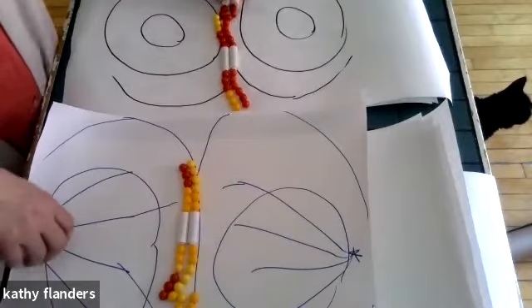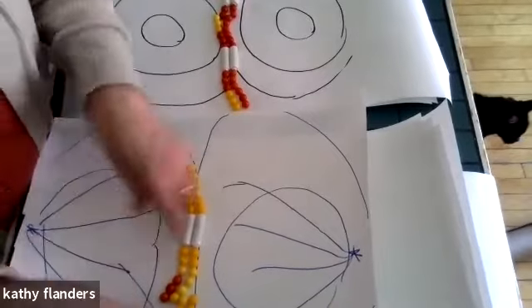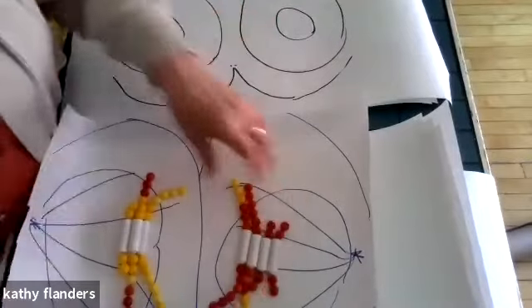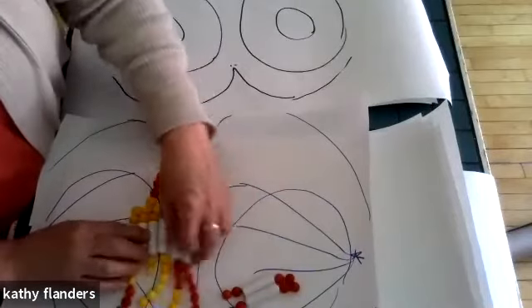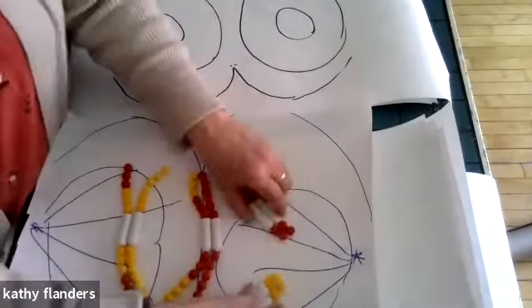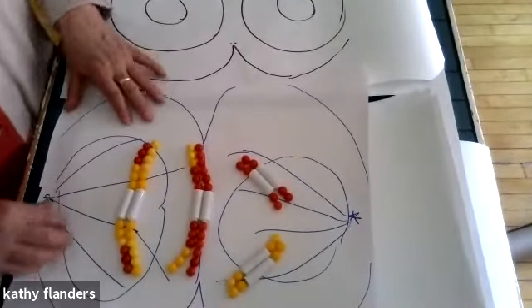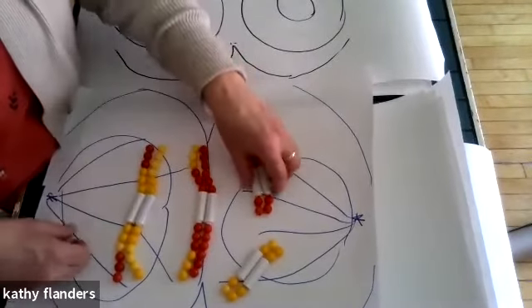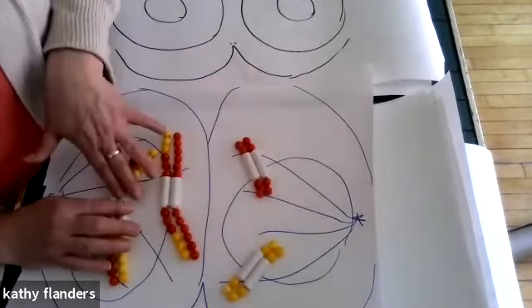Now, I'm gonna go back to the cells before this. So this is what I started with. Now it's going to be easier to do it this way. Sorry about that. But this is the cell I started with. So how many chromosomes did I have in that cell? I ended with 2, but these are all the chromosomes that I started with. I started out with 4 chromosomes. So that's where we can see that I got the haploid number from the diploid number.